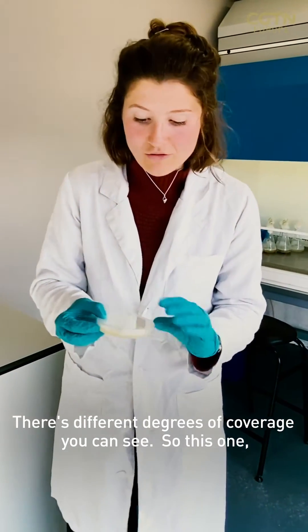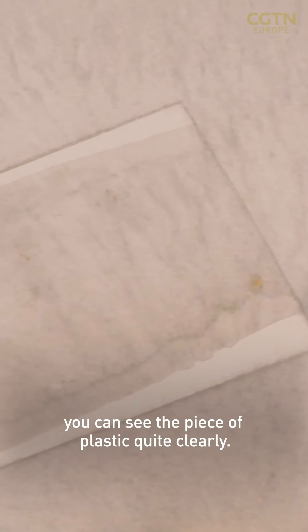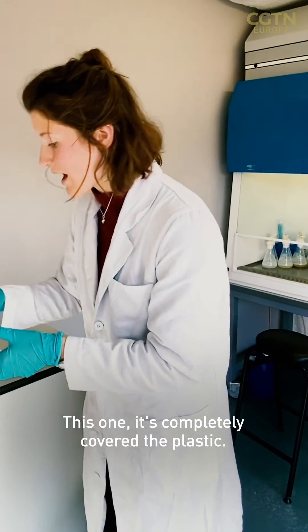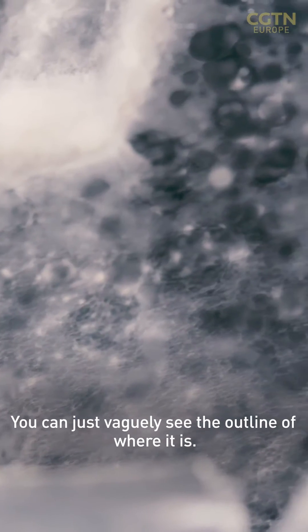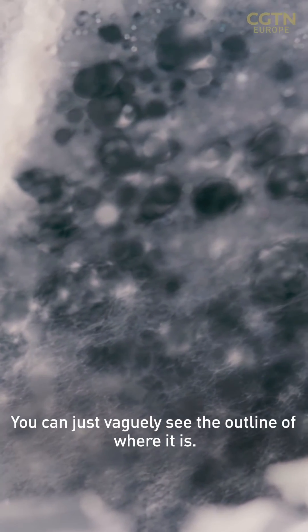There's different degrees of coverage you can see, so this one you can see the piece of plastic quite clearly. This one, it's completely covered the plastic. You can just vaguely see the outline of where it is.